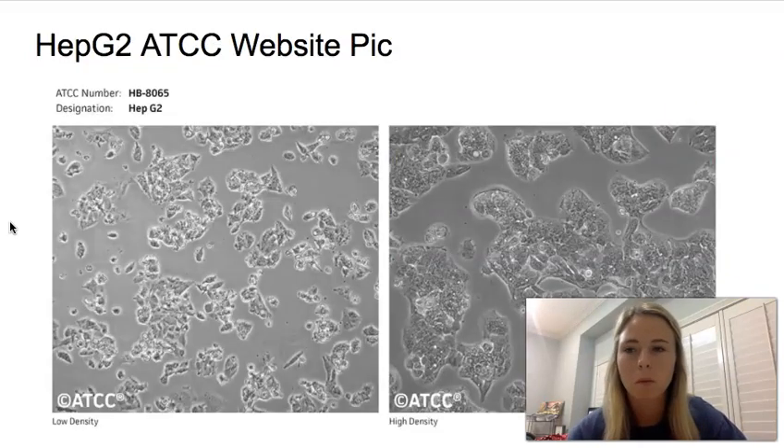One of the first cell lines we worked with this summer was the HepG2. It's a hepatocellular carcinoma, and it's low grade, so it's a little bit less aggressive. Here are some reference pictures on what to expect when growing the cell. You can see in the low density that they grow in little small clumps, and then in the high density, there are some bigger clumps.